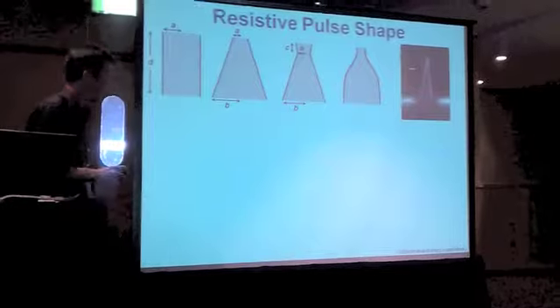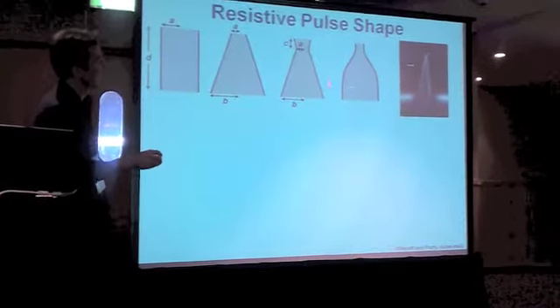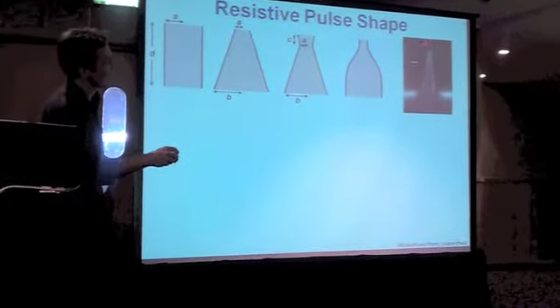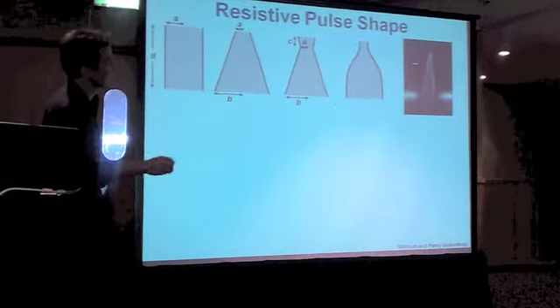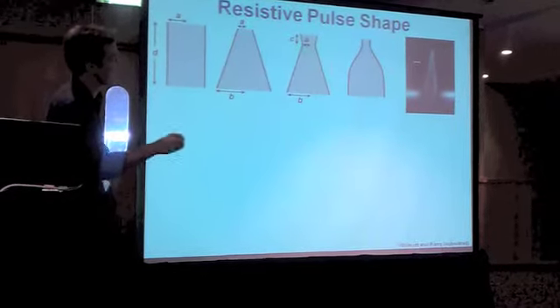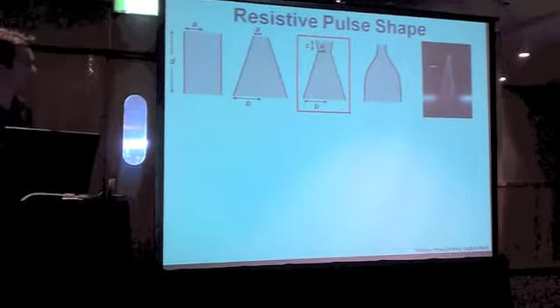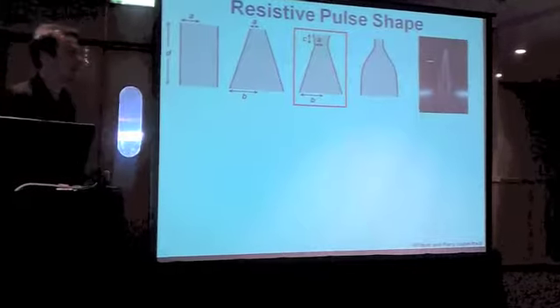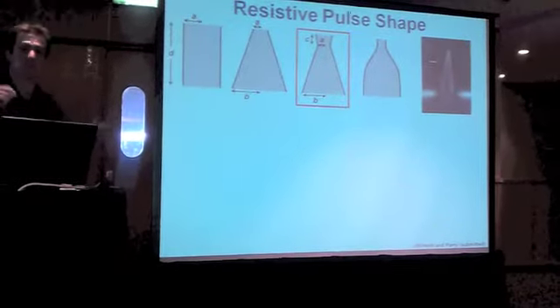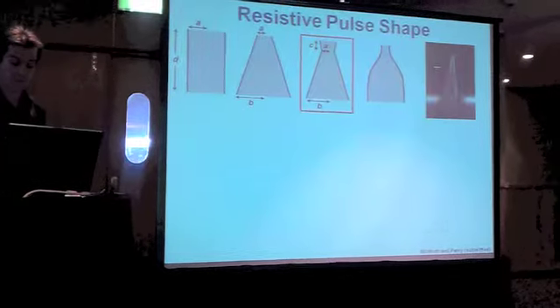So we looked at a few different shapes. That's obviously a cylinder, which is what you saw on the last slide. From the confocal microscopy images, which have been done over in Queensland, the wine glass shape is probably the closest to the truth. That's exaggerated there. But I'm going to finish by looking at some work we did using this shape, which is just a small constriction towards the end, which is supported by some of the microscopy we've done, but the actual constriction of the pore lies just inside the pore entrance.